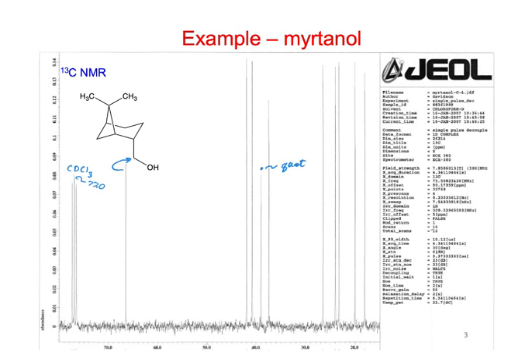The two furthest upfield, my guess would be the methyls. Right, oftentimes they're more upfield, but look at the proton NMR, it could be that they're quite different in here, too. What is the reason to be different? I think they're just in a much different geometry.